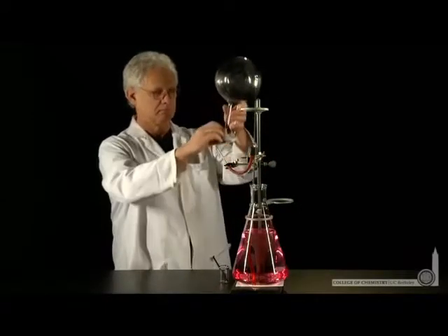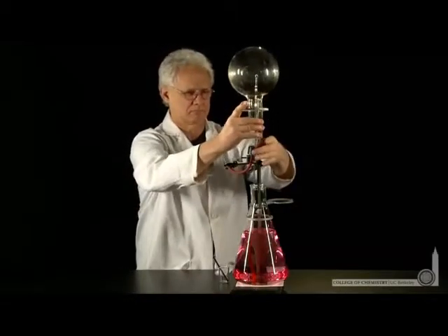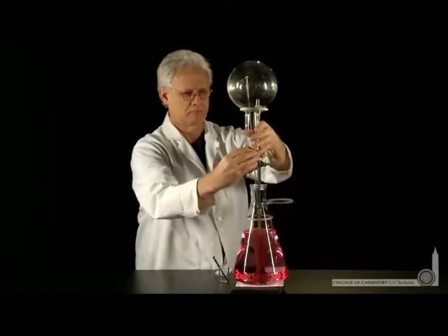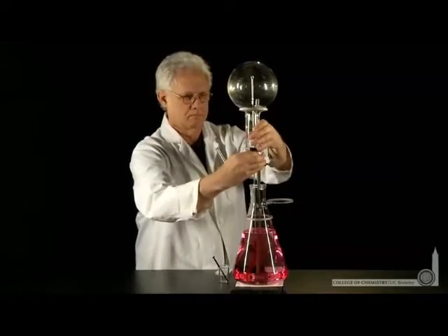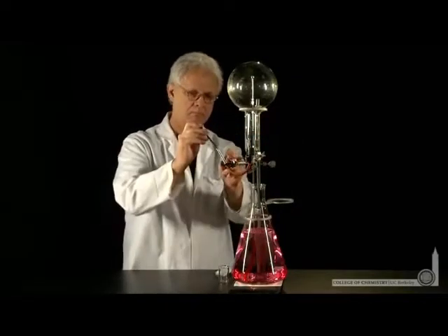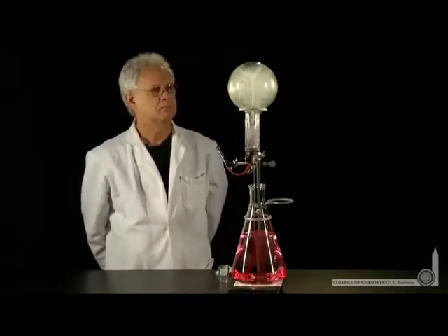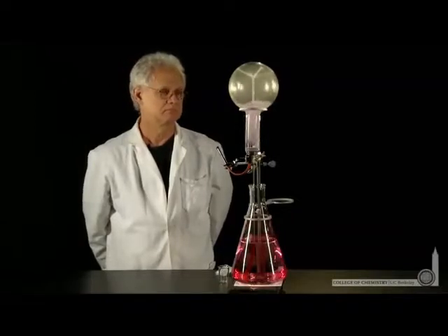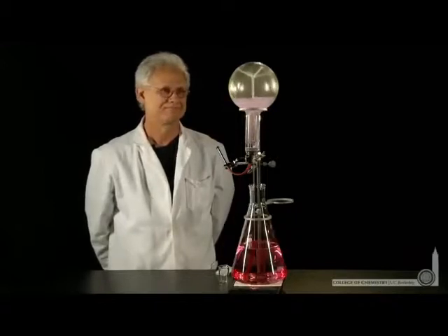This flask that he's opening is full of ammonia gas, and he'll put it on the apparatus and seal it. Now what he's going to do is introduce just a few drops of water into that flask. And since the Henry's law constant for ammonia dissolving in water is over 10,000, ammonia will rapidly dissolve in that small amount of water. What's happening now is the ammonia pressure is decreasing rapidly as it dissolves in the liquid.